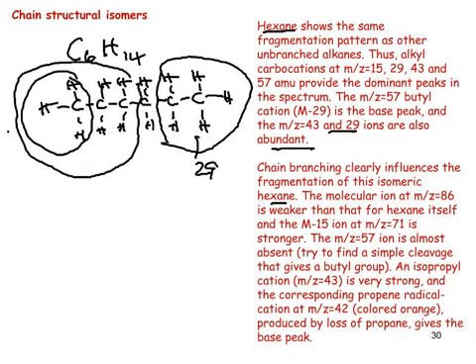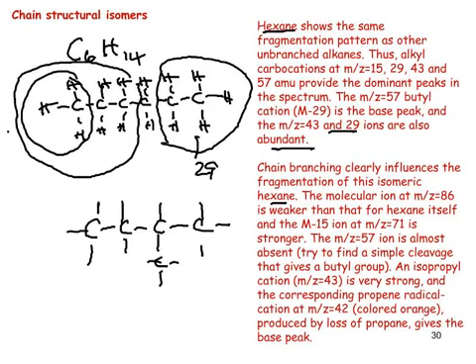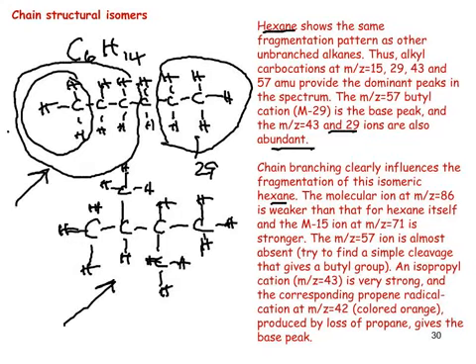If you put in a hexane and then a structural isomer of hexane, for example, let's pick a relatively simple one where we reduce it to a 4 carbon chain and stick a methyl group on, let's say, in those 2 positions, when you get the graph from a computer printout of these separately, the printout would immediately show a striking difference between these 2 samples, because the kind of fragmentation you get would be quite different. I'm not going to go into the detail, but you can pause if you'd like to read more of that.